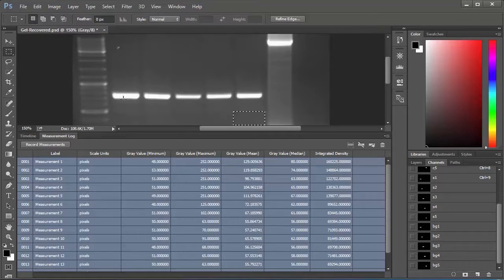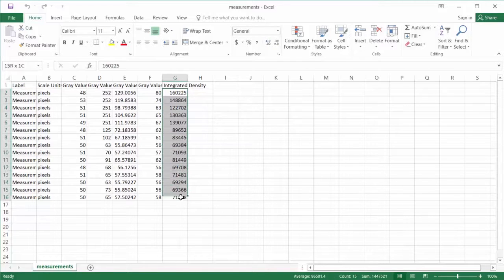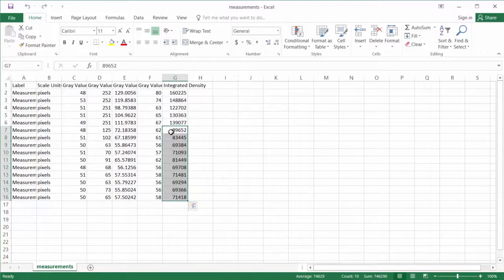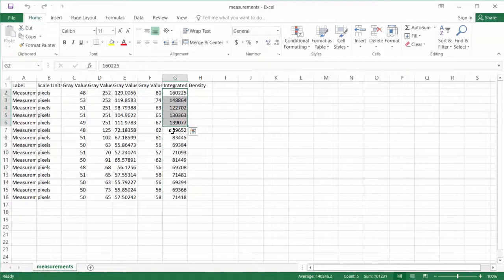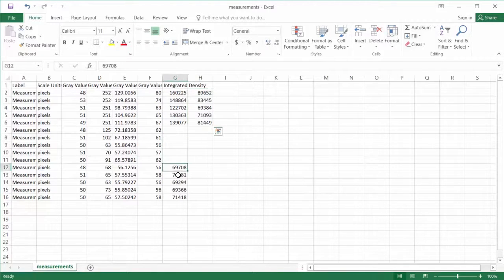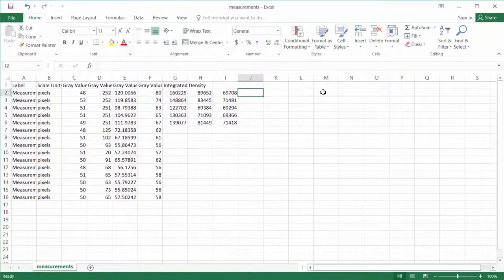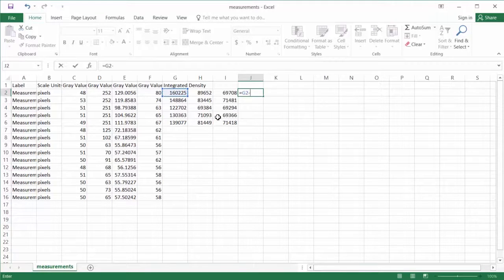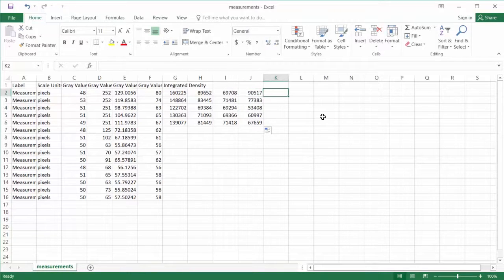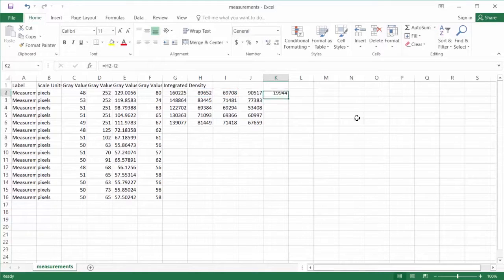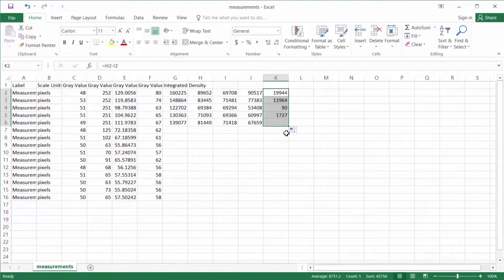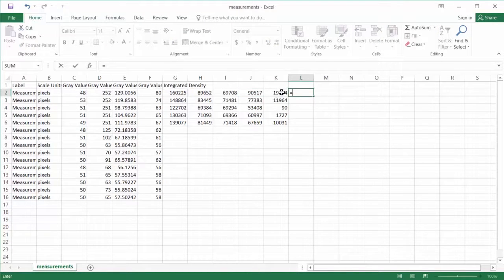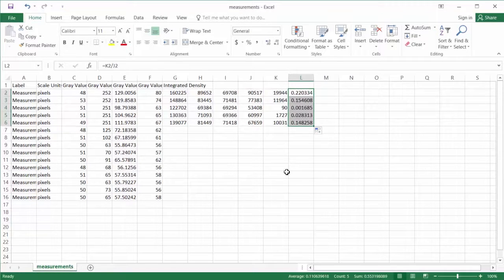We've got our data imported into Excel here and you can see our integrated density values along this column here. I'm just going to reposition them so we've got our first five here are the control bands, the next five are the sample bands, and then the last five here are the background bands. It's just a matter of going through and subtracting the background out from our other two values. Now with these two values we just take the ratio of our sample band over our control band so that we're normalizing.